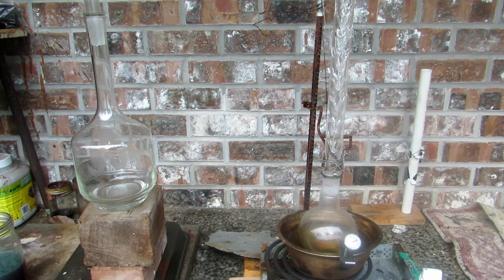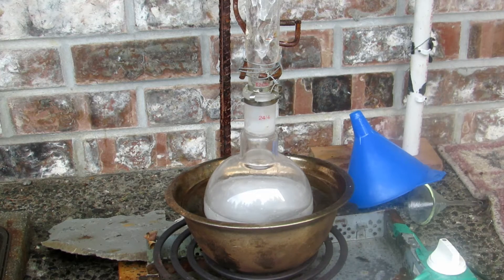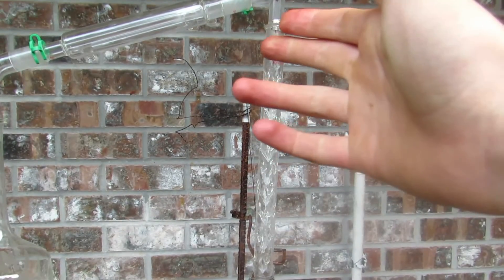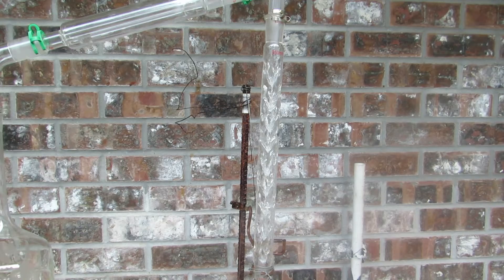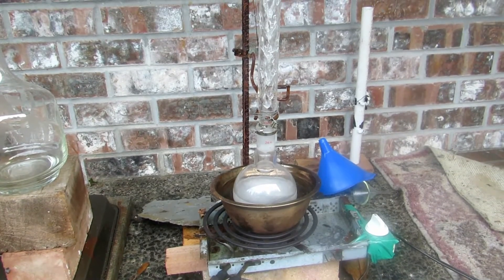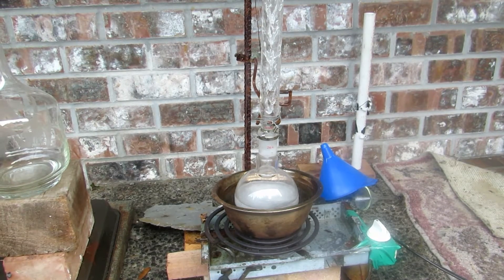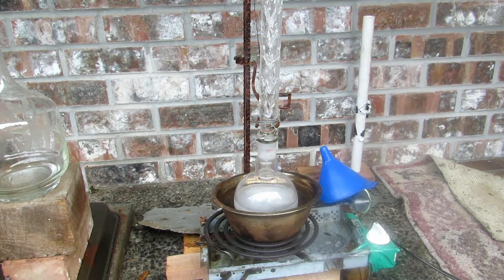I had to pour it straight in — using the funnel was a bad idea. I had to take off the top joint of the condenser column and dump it down. Now the column is all filled with the gel goop, and hopefully that clears up as the temperature rises. I've put the thermometer in place at the top and set up the water condenser. Pretty soon we should start to see bubbles of dichloromethane forming as it boils out.